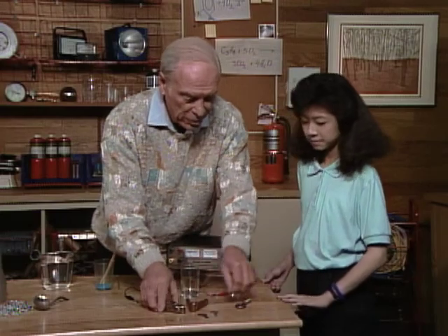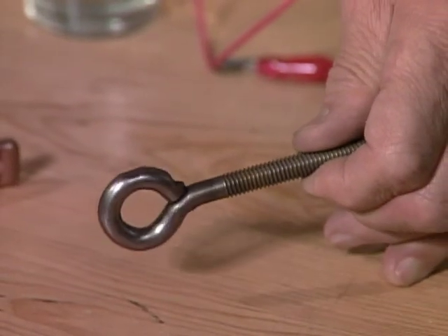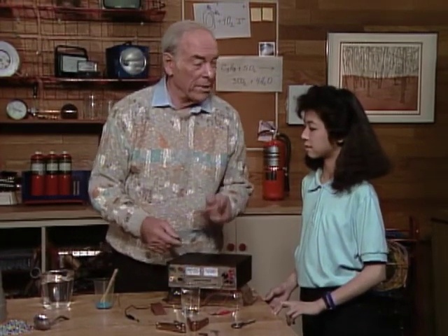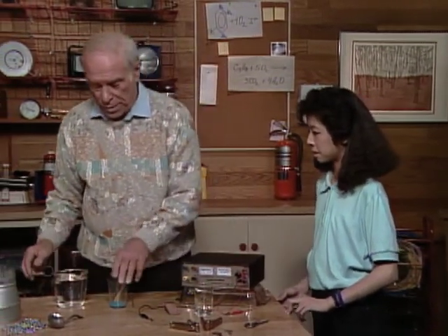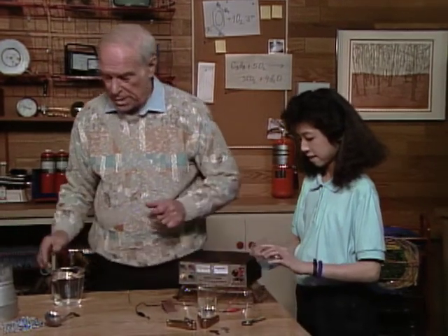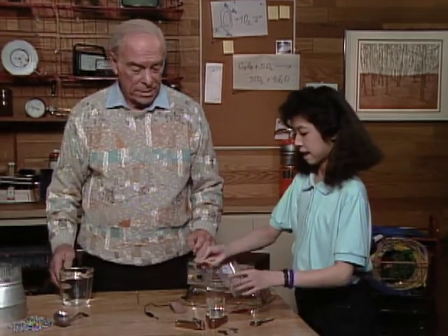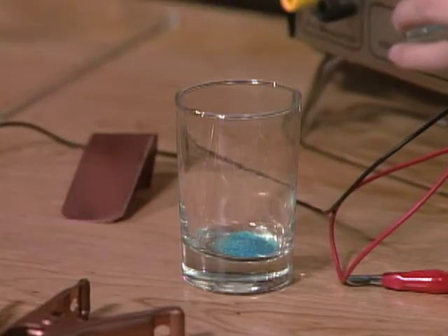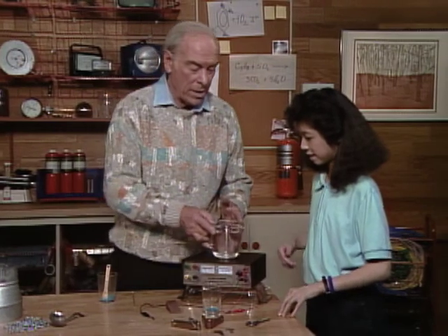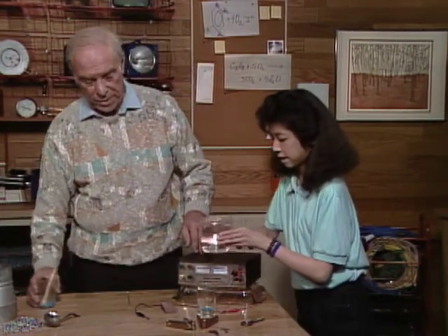And here's what you're going to plate — an iron eye bolt. Now what you need is, first of all, a supply of copper in solution. So here's the copper in chemical form — we'll put it in that glass. Nice blue color. Yeah, copper sulfate.